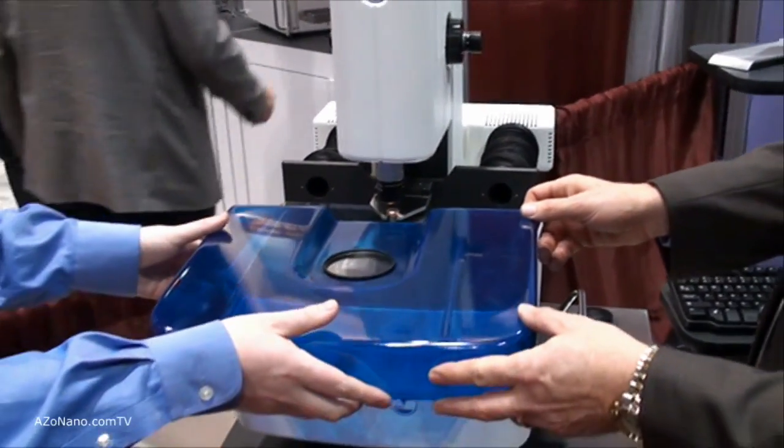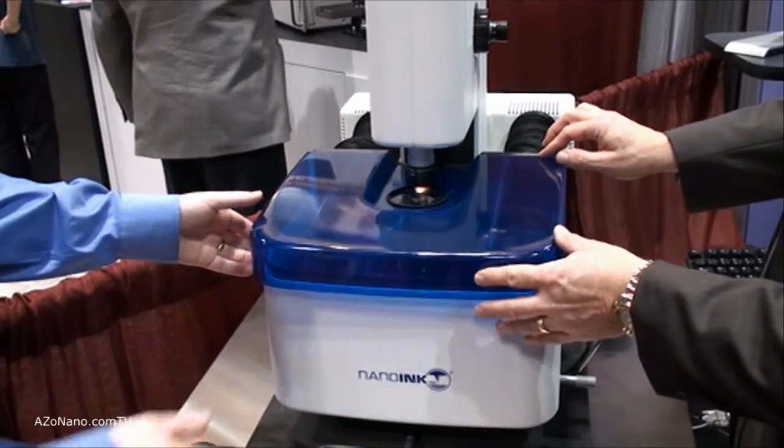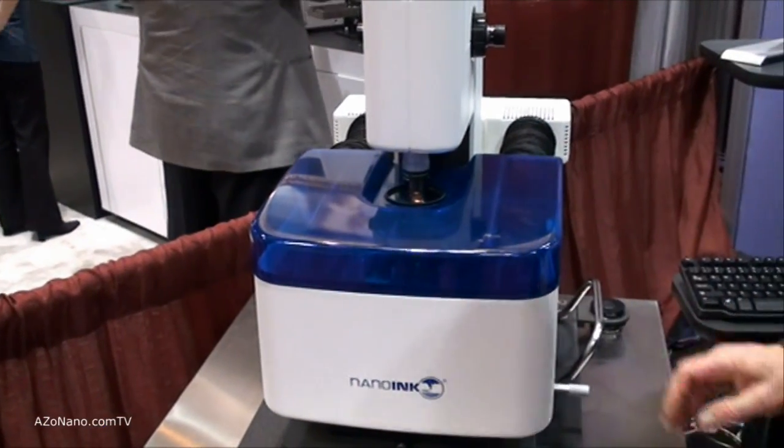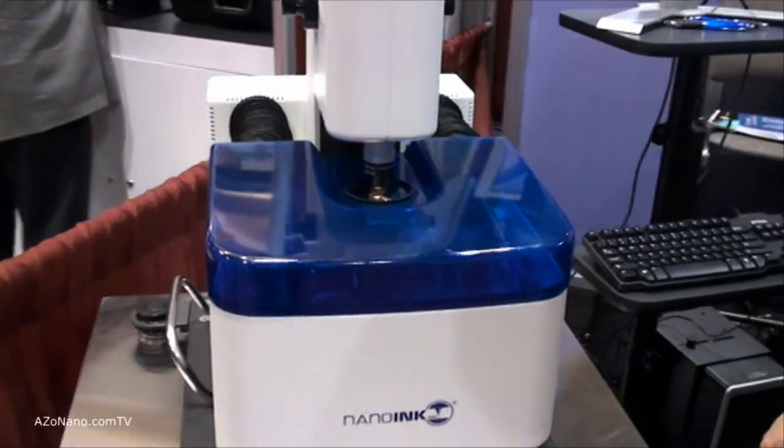And that sits normally on the system, and we'll put this back on so that you can see, forming an environmental controlled area over that very large area.